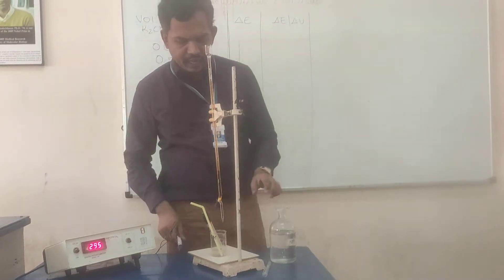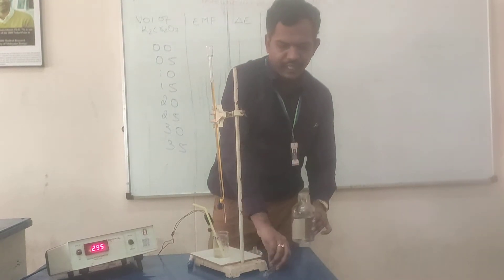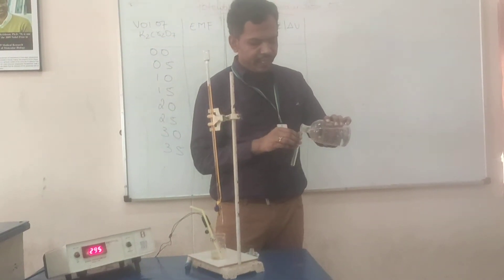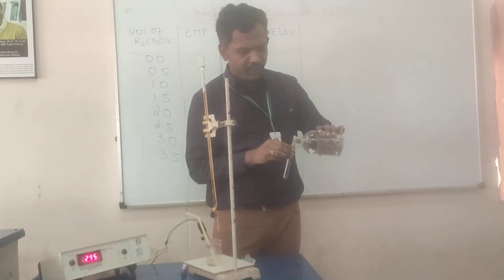So, to this, we are going to add one milliliter of sulfuric acid in order to prevent air oxidation of Fe²⁺ to Fe³⁺.